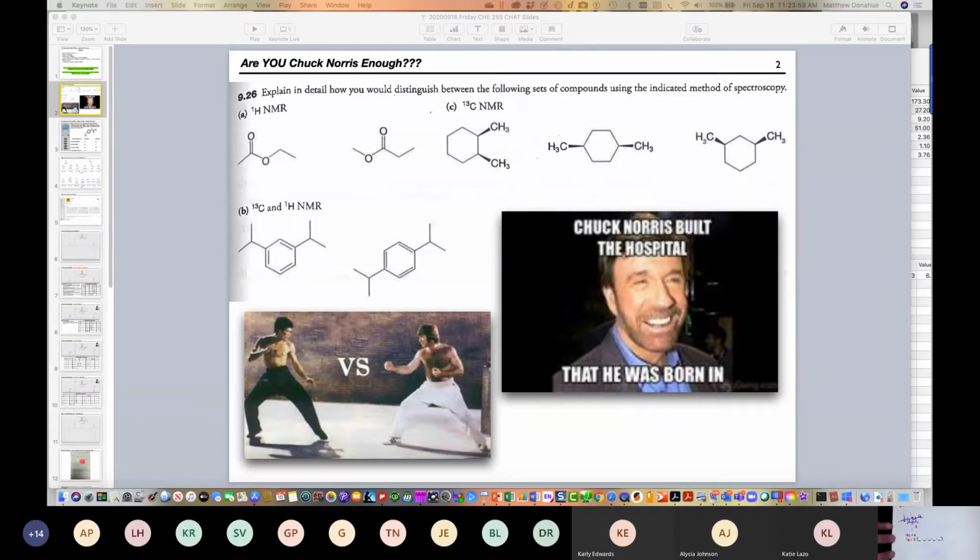So we see some early responses. Again, make sure you're trying to do this on your own as well, because that's really where you learn the material. So yeah, if we consider the methyls, we have 3, 6, 9, 12.